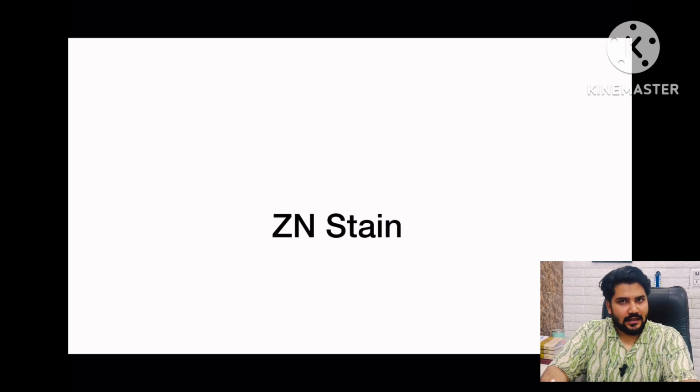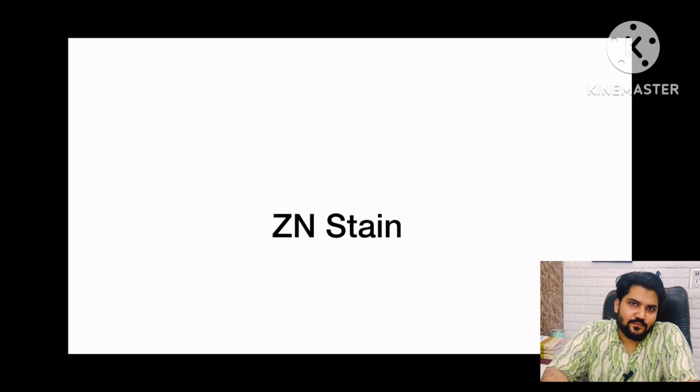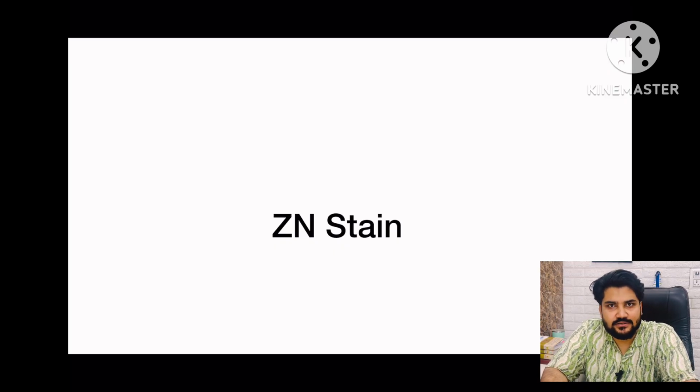कैसे हैं आप लोग? आज हम न्यू टॉपिक स्टार्ट कर रहे हैं जिसका नाम है ZN स्टेन, जिसको हम ZN स्टेनिंग कहते हैं. जनरली दिस इज फॉर ट्यूबरकुलोसिस. दिस इन्फेक्शन बिलोंग्स टू ट्यूबरकुलोसिस.